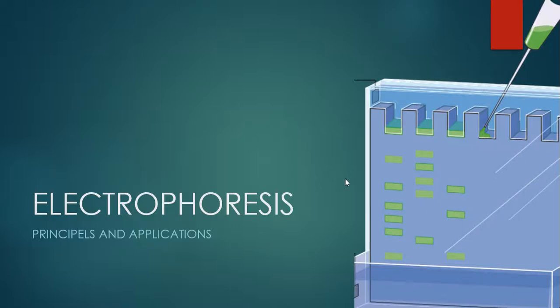Hi everyone. Now we are going to discuss a topic called electrophoresis. Yes, electrophoresis. In this topic also, we are mainly dealing with principles and applications of electrophoresis. So this is an electrophoresis diagram that is going to show all the different bands of the molecules that you are going to separate.